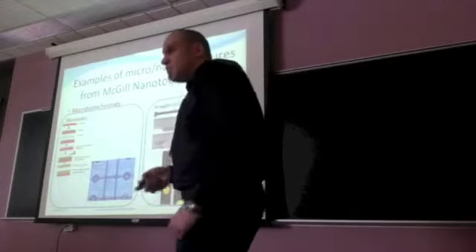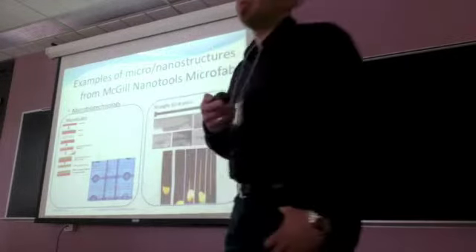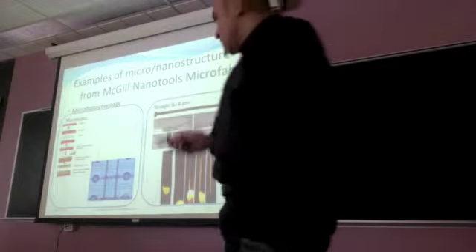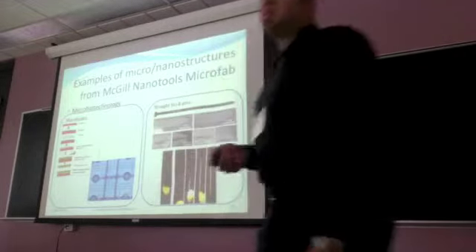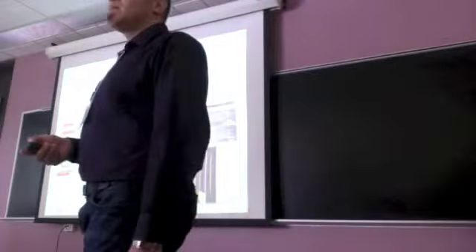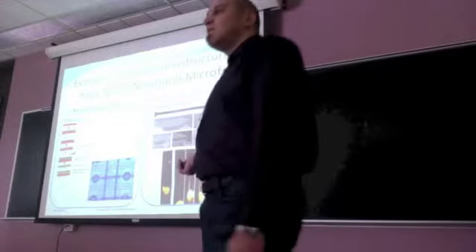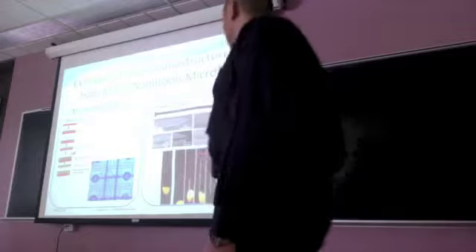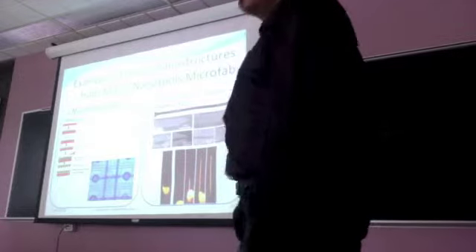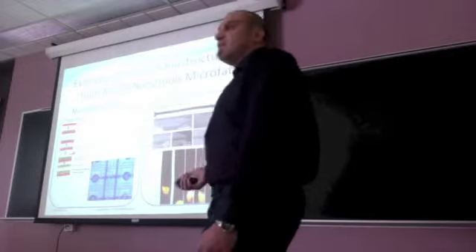In microbiotechnology, as I told you, PDMS molding is widely used in David Juncker's group, and I think other labs, to make microchannels. In fact, the first step is to fabricate an SU8 master in the clean room. This structure is very interesting. It's a kind of micropipette made in an SU8 layer, and you can pick up some biological solution with this pipette. You will get further details on these structures in the next presentation, I think.